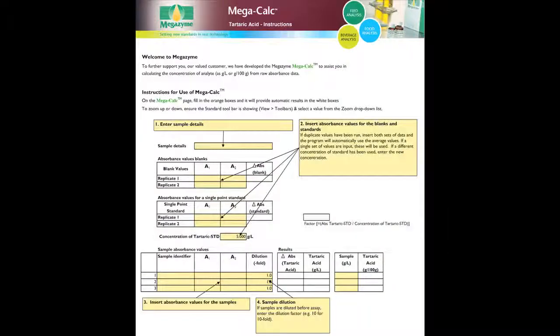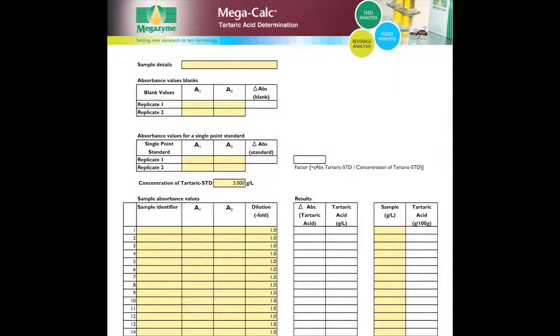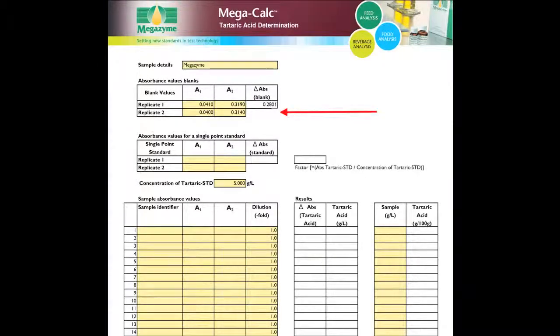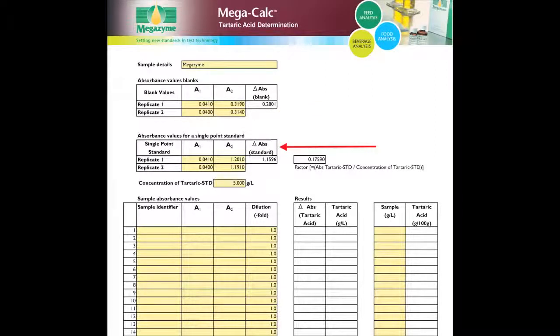The first worksheet of the MegaCalc application shows the instruction page, which details how to fill out the MegaCalc worksheet. To fill out the sheet, first input the sample details, then input the absorbance values A1 and A2 for the blank samples, then input the absorbance values A1 and A2 for the single point standard. Then input the sample identifier for the test samples, followed by absorbance values A1 and A2. If any further dilution was applied to the sample prior to analysis, input the appropriate dilution factor. If no dilution was applied, leave this value as 1.